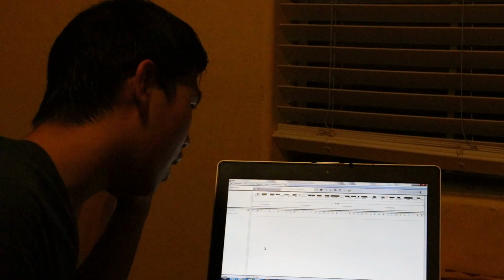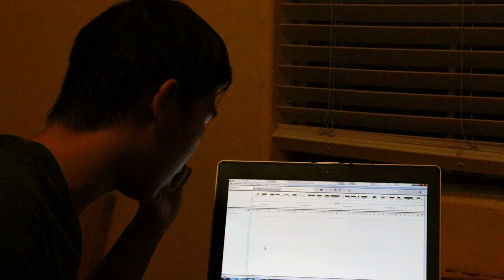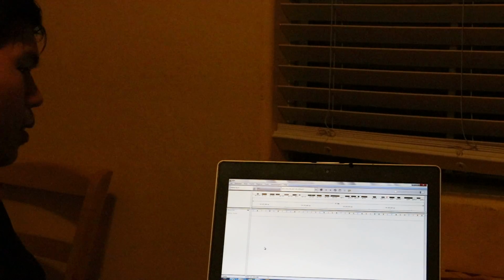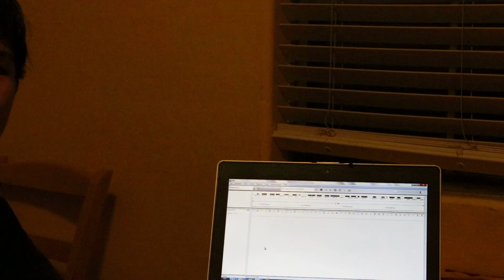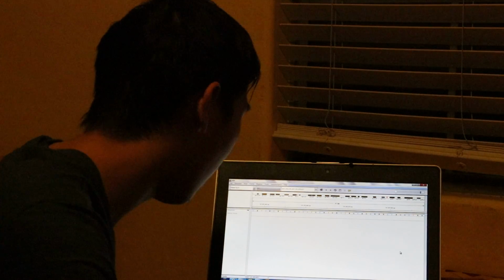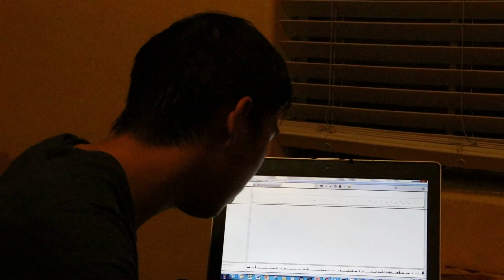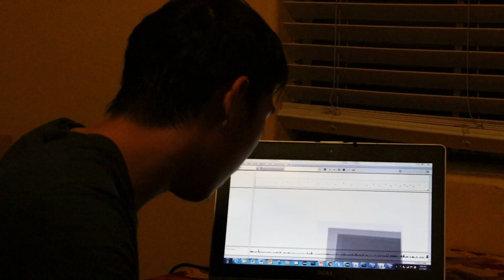As you can see, it's navigating through the chromosome locations and taking pictures of these chromosome positions with the snapshot features implemented in my program. After it's done navigating, the GUI is able to close down, and we're left with a PDF report.